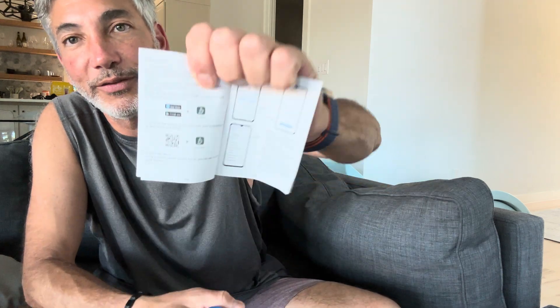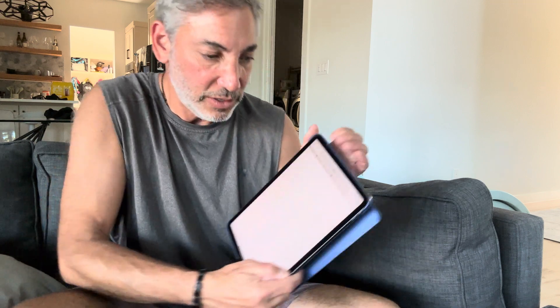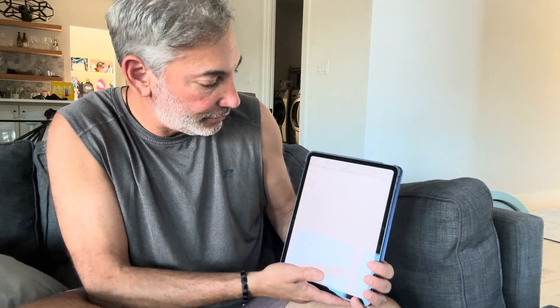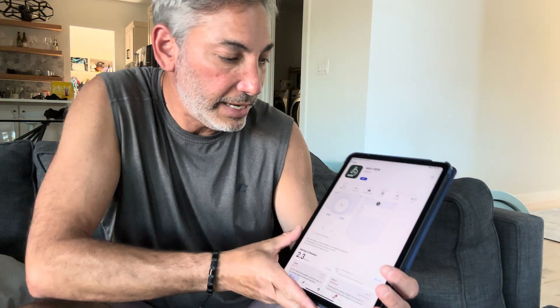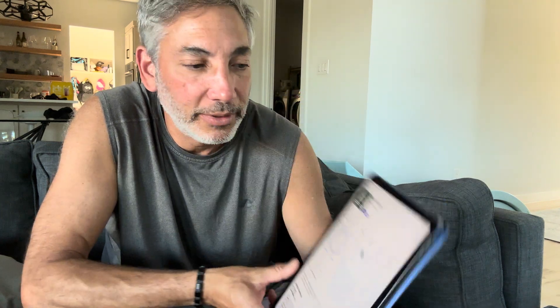I think we're gonna have to install an app — I can't remember what it was called. It comes with a little barcode, so scan that and it'll give it to you. I'm going to do it from my iPad. Okay, so the app is called MaxView. It's installing and now it's installed.